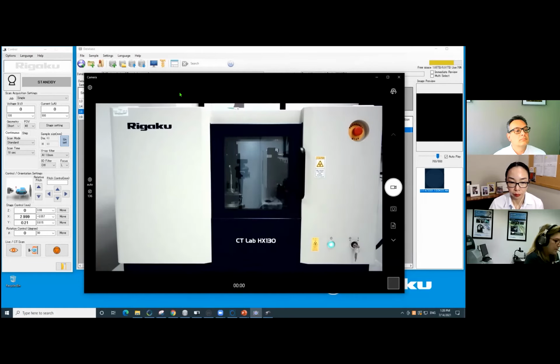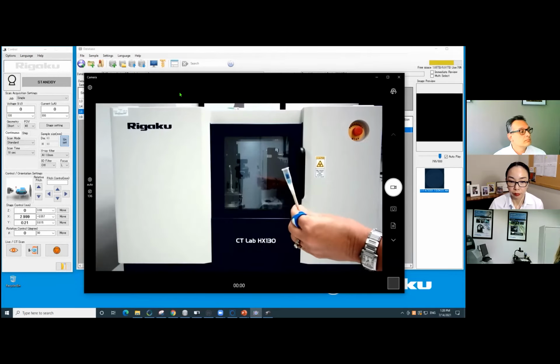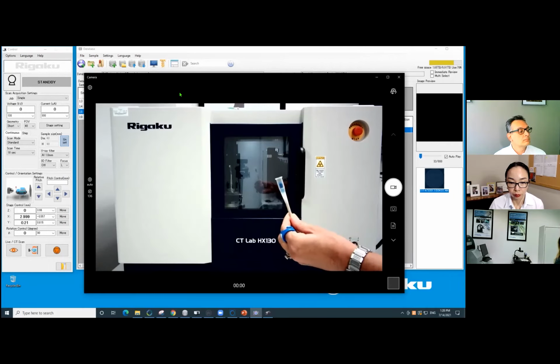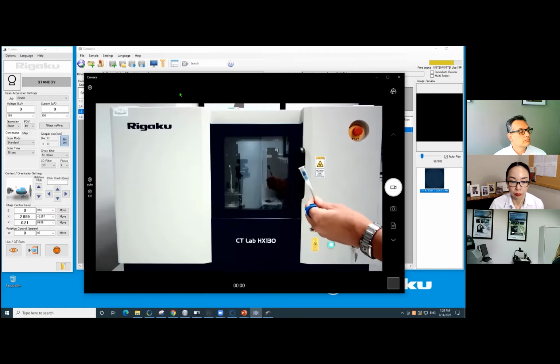Remember I mentioned at the beginning, we were going to do a bit of a time resolved. Well, this is just a simple example that you can do anywhere. I've got a pain relief pill. It's over the counter, something you can get at any sort of pharmacy or grocery store. And what we want to do today is to ask the question, what happens to it when it's ingested?